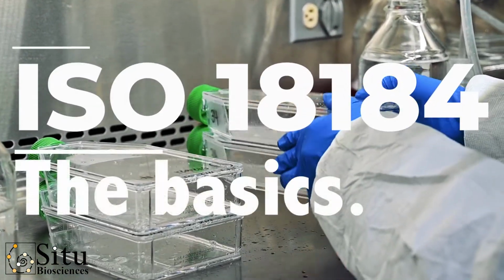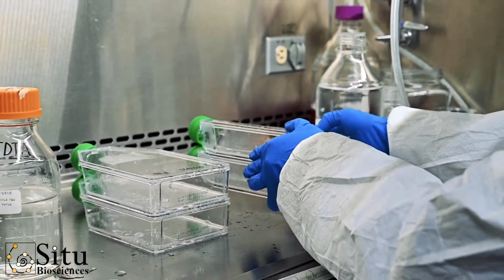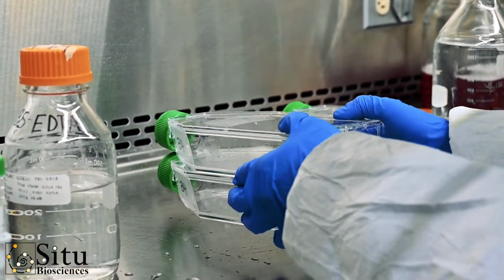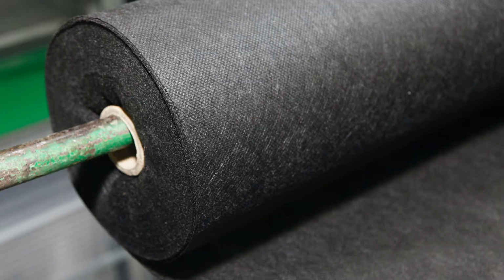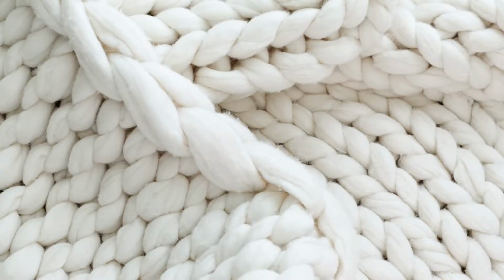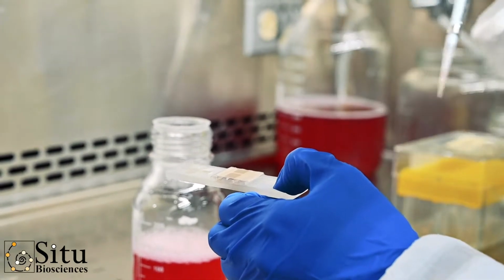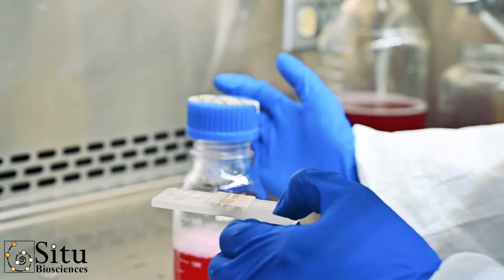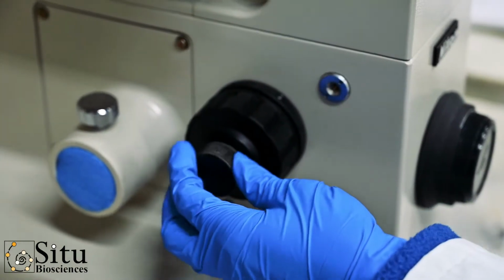ISO 18184 is a textile test that measures the antiviral activity of samples and other porous materials. It's a quantitative test method used to assess the antiviral performance of such products. Textile products include woven, non-woven, knitted fabrics, fibers, yarns, braids, as well as other types of materials appropriate to the method. The ISO 18184 test standard is designed to test the ability of textiles and other similar materials to kill viruses. Standard virus exposure times range from 2 hours to less than 24 hours.